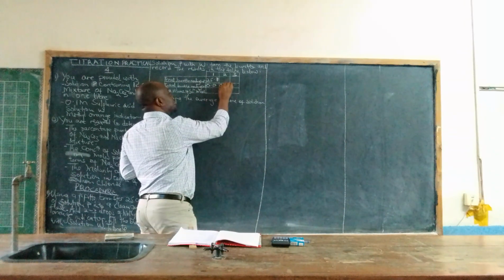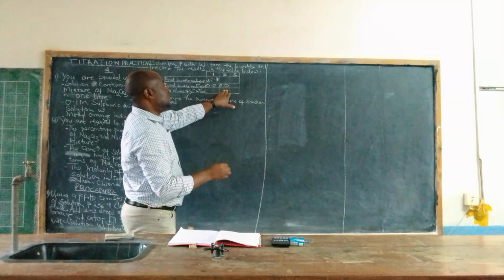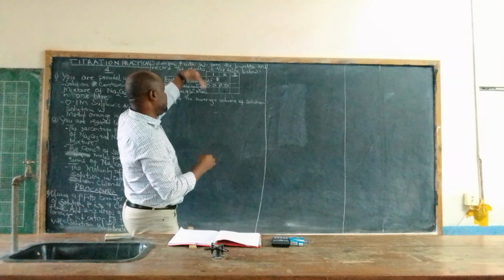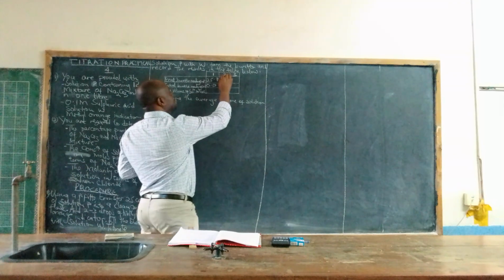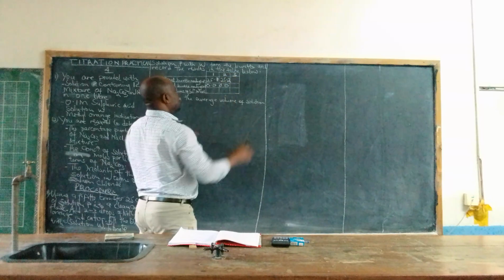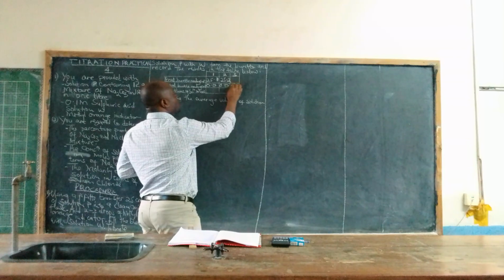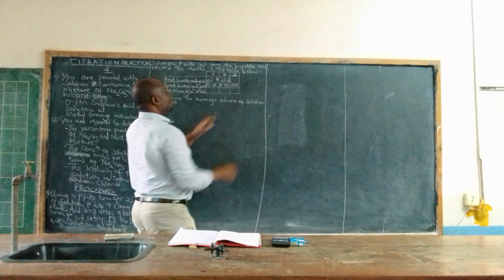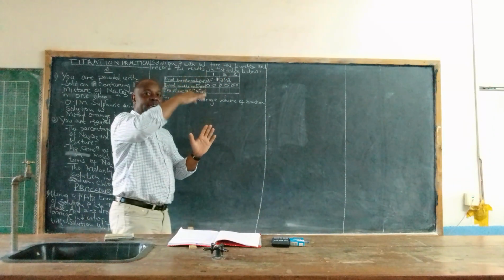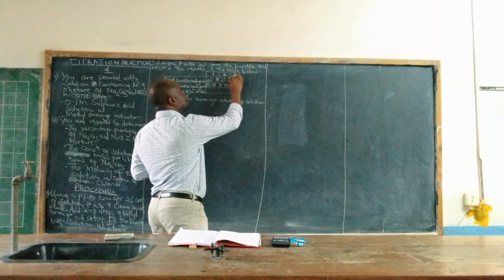So we restart our titration on the second column of this titration table. Maybe we say we have titrated, and it changes at around 25.2. Then we refill the burette again up to the 0 mark. So we have our initial volume at 0.0. Then we titrate, and our end point comes at around, let us say, 25.0.